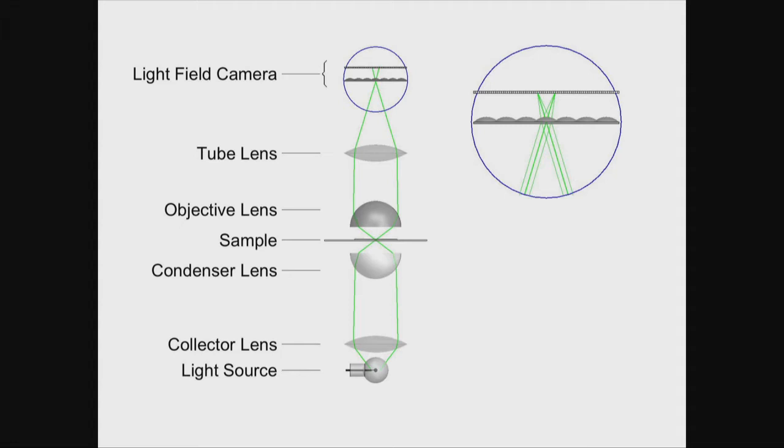If you know how much light has gone through a small volume in space in different directions, that's a term that was coined, I think, in the 1930s, a light field. You know not only the position, but also the direction in which the light propagated through a volume element. Then a graduate student of Mark Levoy, who worked on this field in computer graphics, maybe Mark Levoy rings a bell with some of you, he now works with Google.